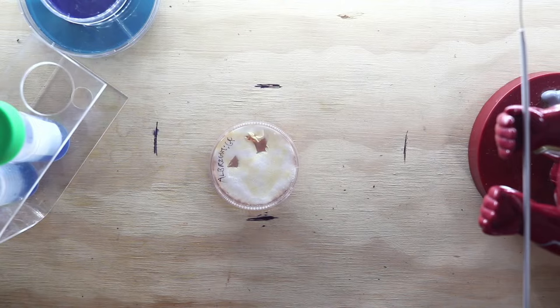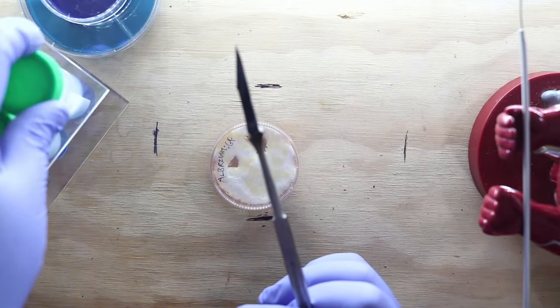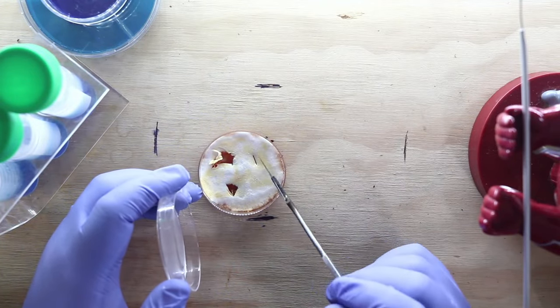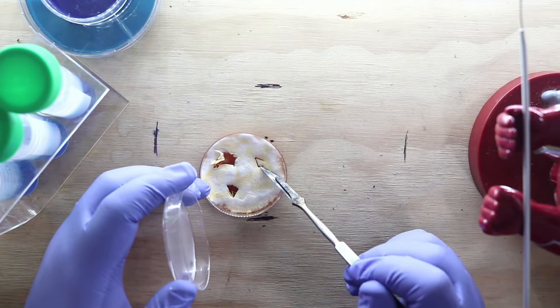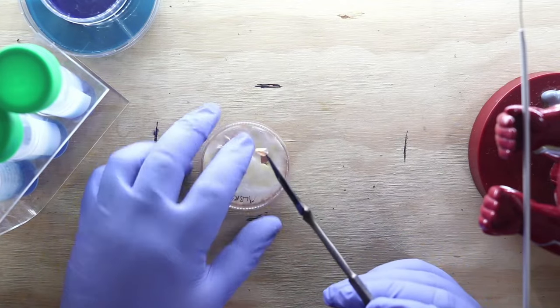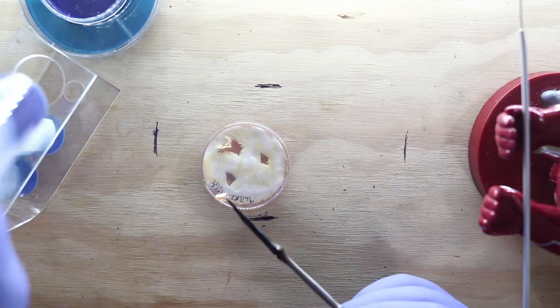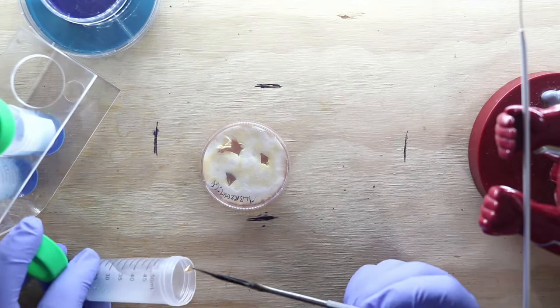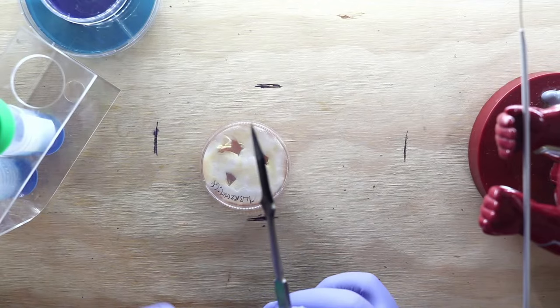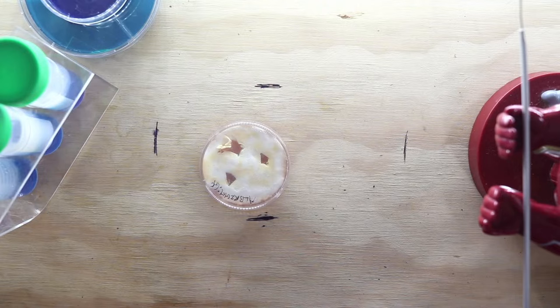Chris has asked how many slants of each strain do we keep, and how many total are we storing? So, I have ideal, and then I have reality. Ideally, hold on one second. Oh man, I can see the smoke still, or the fog coming out of it still. And yes, all of these are open air transfers. We've got the hood right there. Well, you said open air transfer earlier.